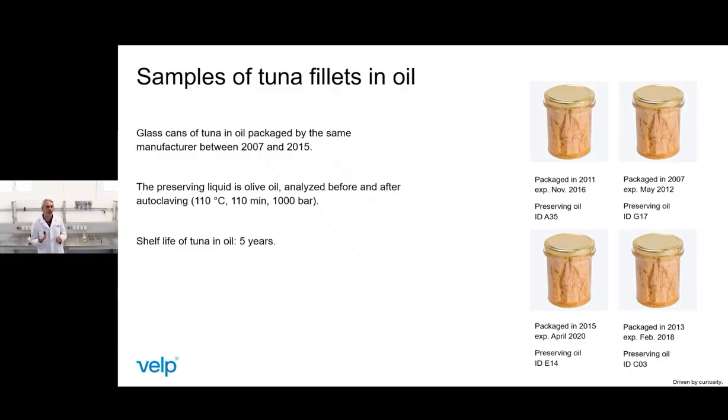Starting from the available sample, 4 experimental groups with different aging status were created. For sample 1, the aging time was 6 months. For sample 2 it was 3 years, 4 years for sample 3, and 8 years for sample 4. The induction period was then measured in all experimental groups for both tuna and drained oils.